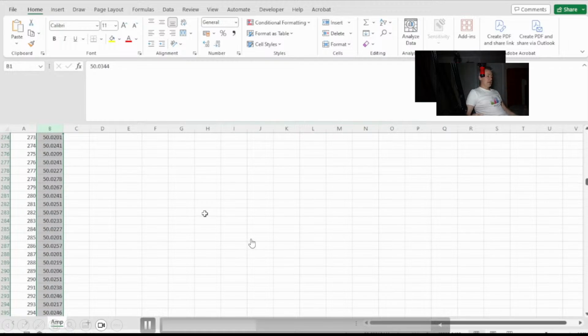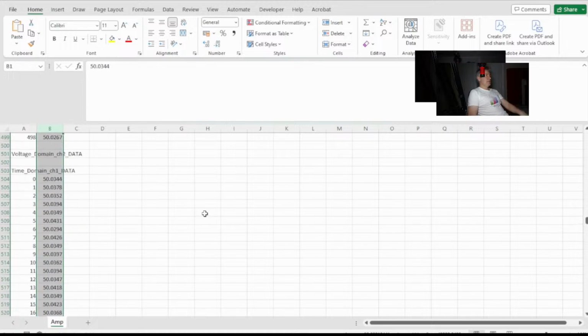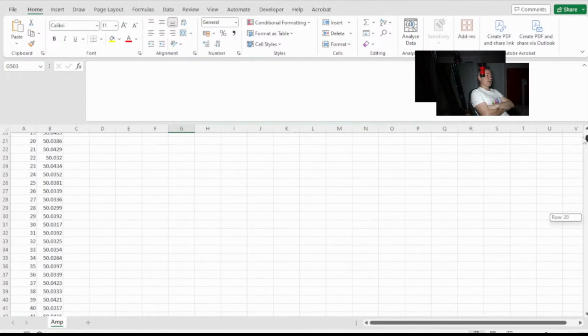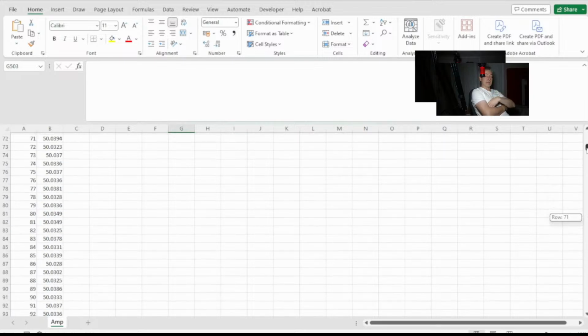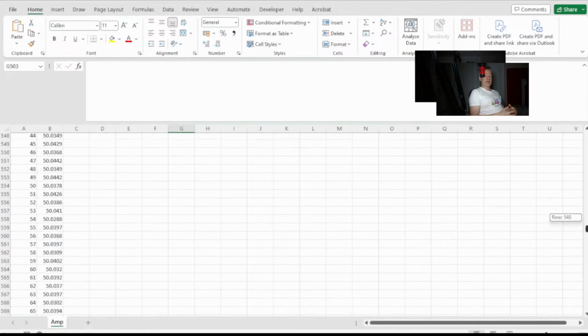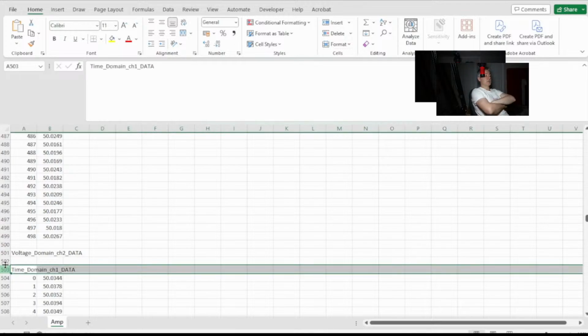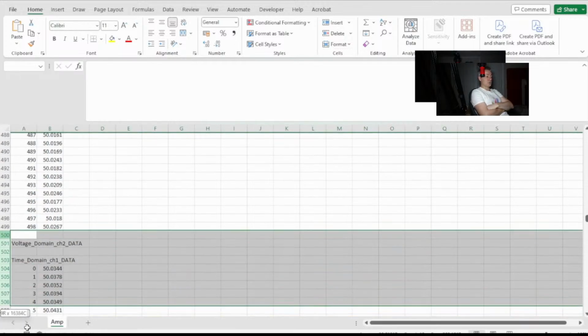The reason being is I think Djuli is particularly set up to expect potentiometric data, or open circuit potential data, or amperometric data, or voltammetric data, but it's generally looking for 2 columns. I'm one of the founders of the company, and we have quite a few data scientists, and what we've done is set it up so it looks for 2 columns of data.